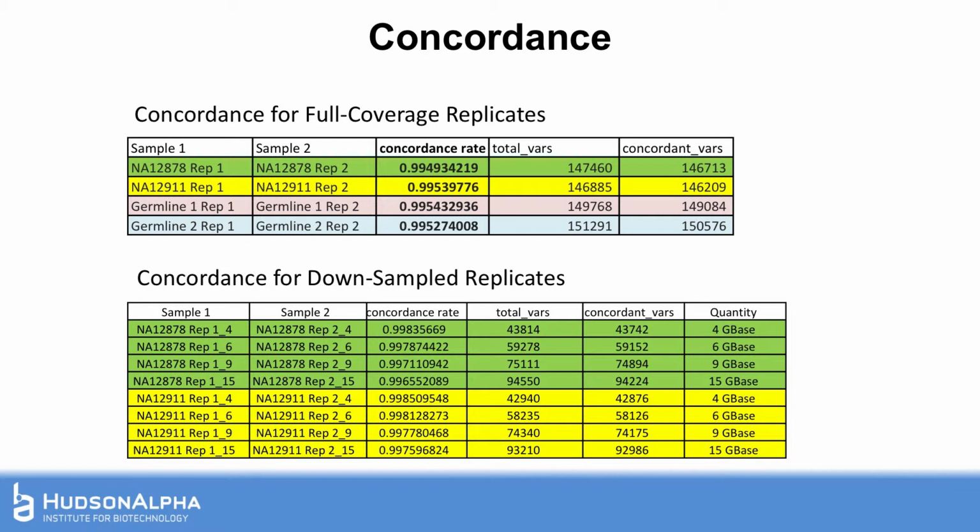Notice they rise as the data rises, and the reason simply for that is that the variants that made it into this calculation had to have a coverage of at least 20x with a PL score of 30 or higher. So high quality variants with reasonable coverage went into the calculation, and not surprisingly, as you increased exome coverage, you increased the number of variants that went into that calculation. But note that the concordance rates still all remain pretty strong.